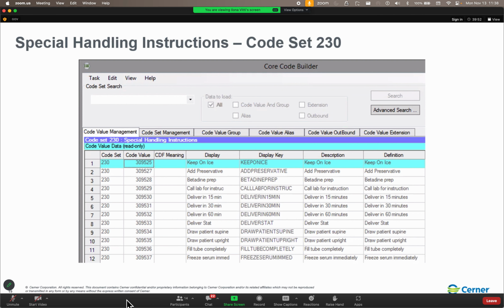The system is going to look for orders with that last 4 to 6 digits on their accession number that is current day up to 30 days in advance in this case. Now, luckily, most of the newer analyzers are able to handle longer barcodes, so this isn't as much of a thing as it used to be. So we don't have to truncate quite as much as we used to. So that part is not as big of a deal now. So just set it 30 days and call it.